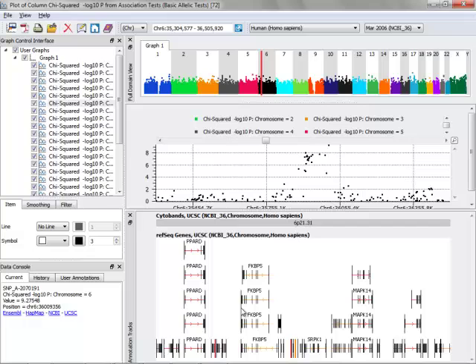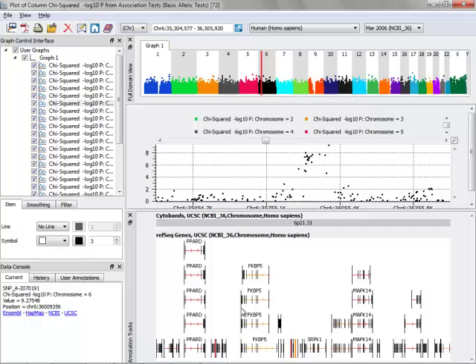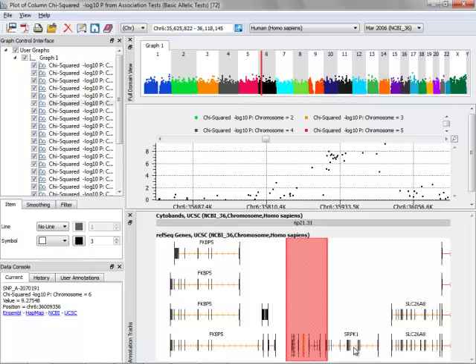I can also continue zooming in on this region by left-clicking and dragging until I can see actual individual genes all the way down to the codon and exon levels.